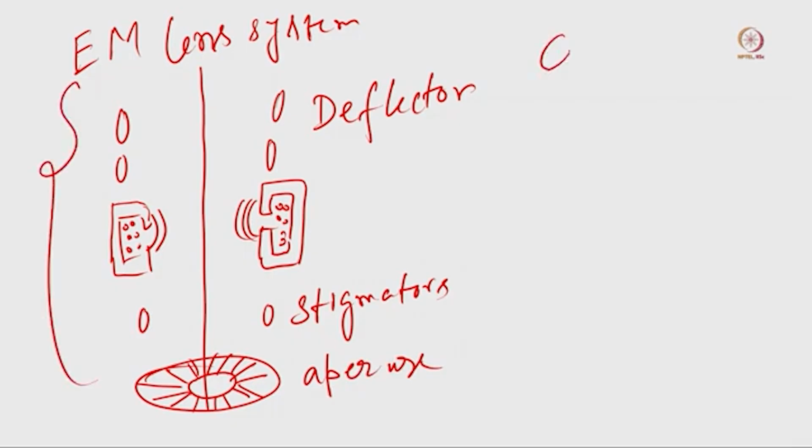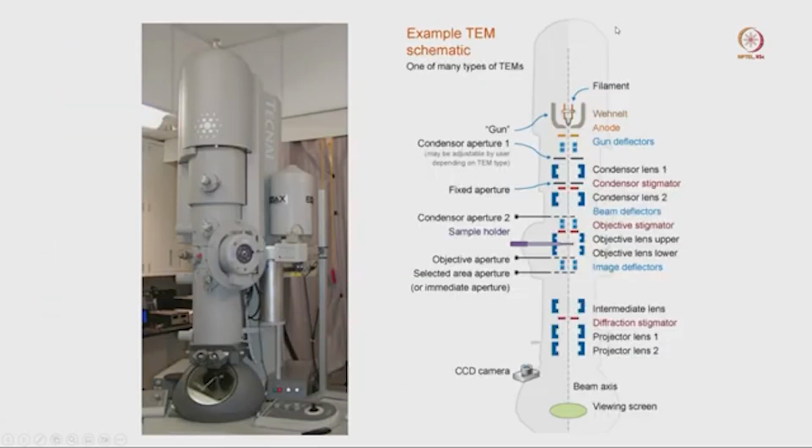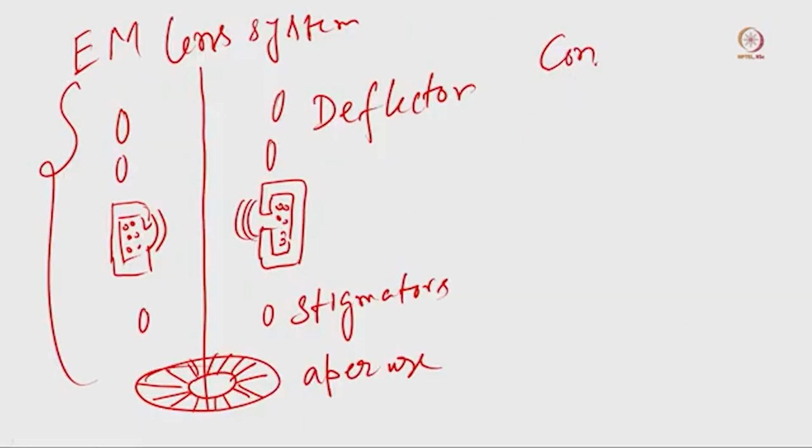Whenever I am talking about condenser lens 1, condenser lens 2, then objective lens.